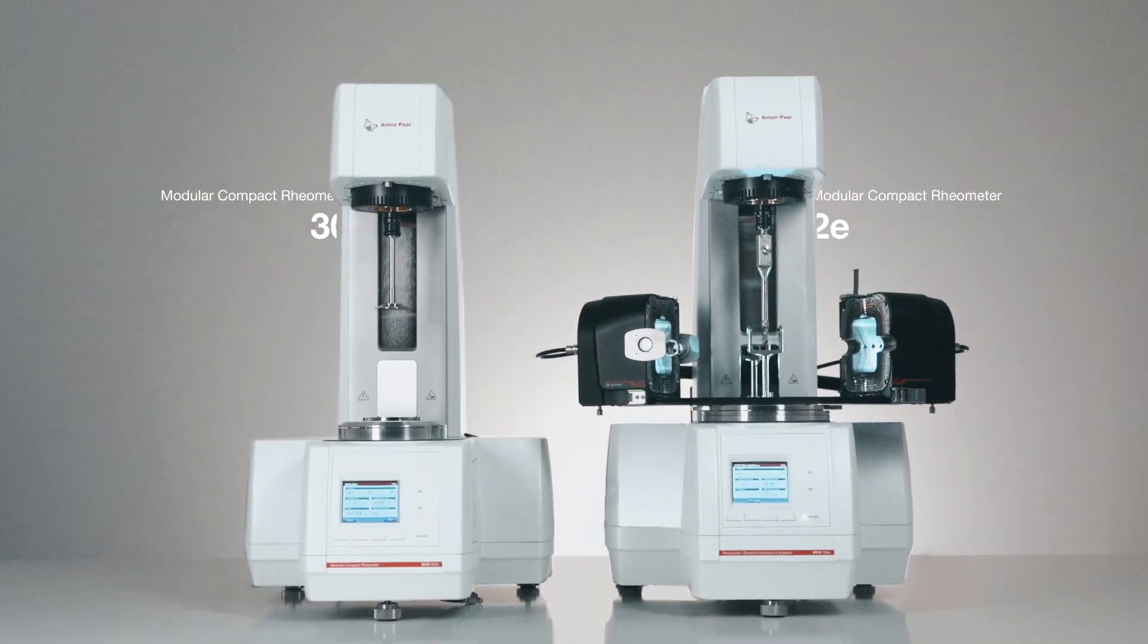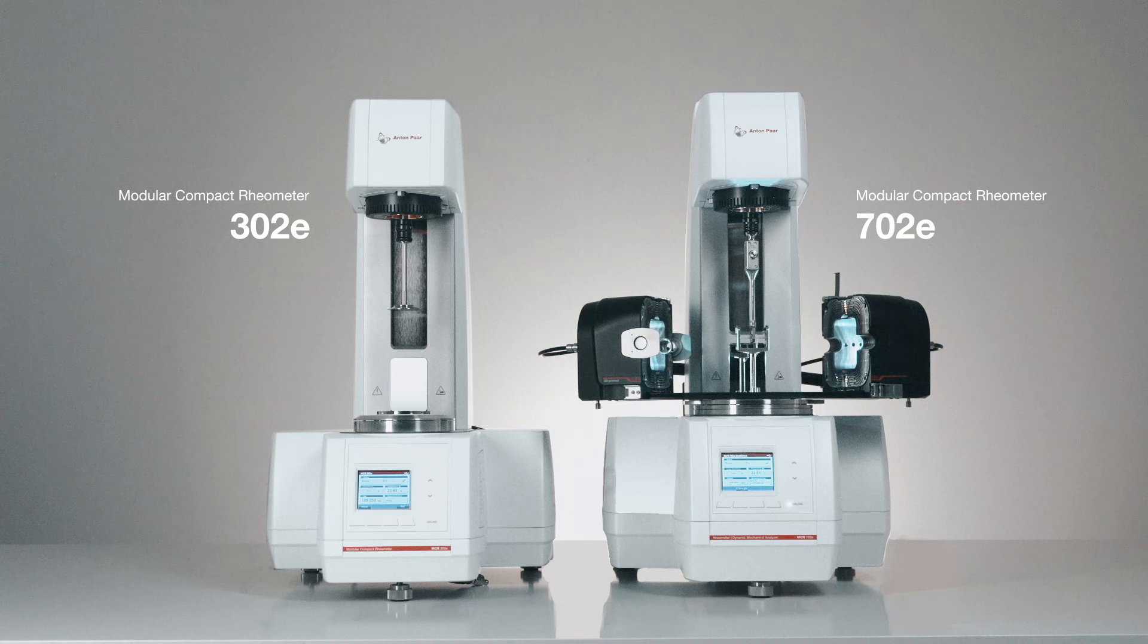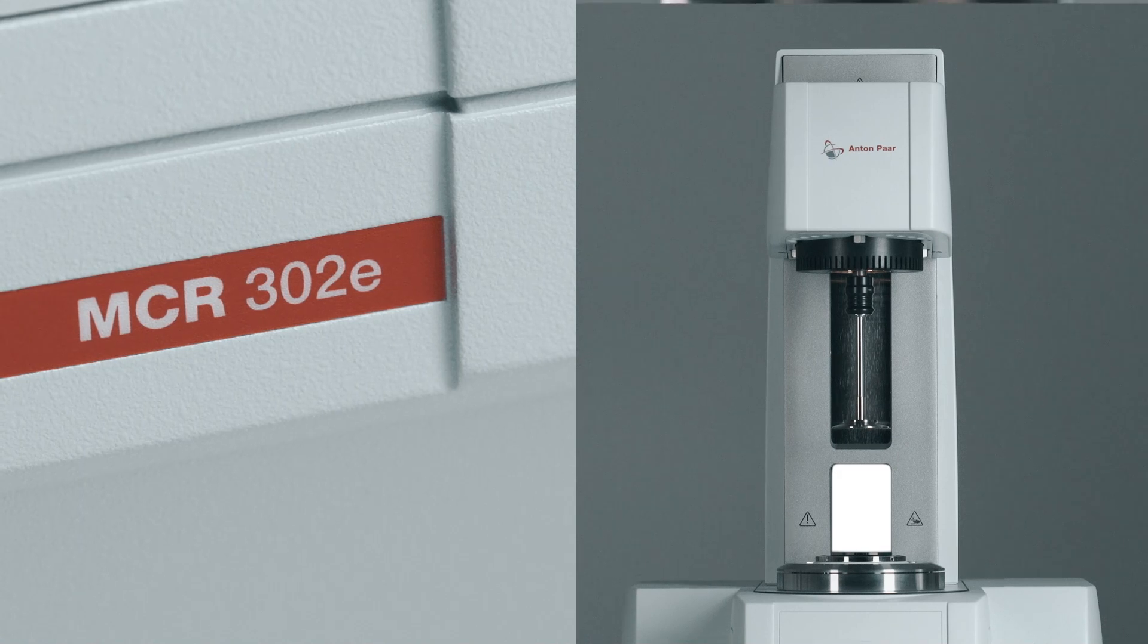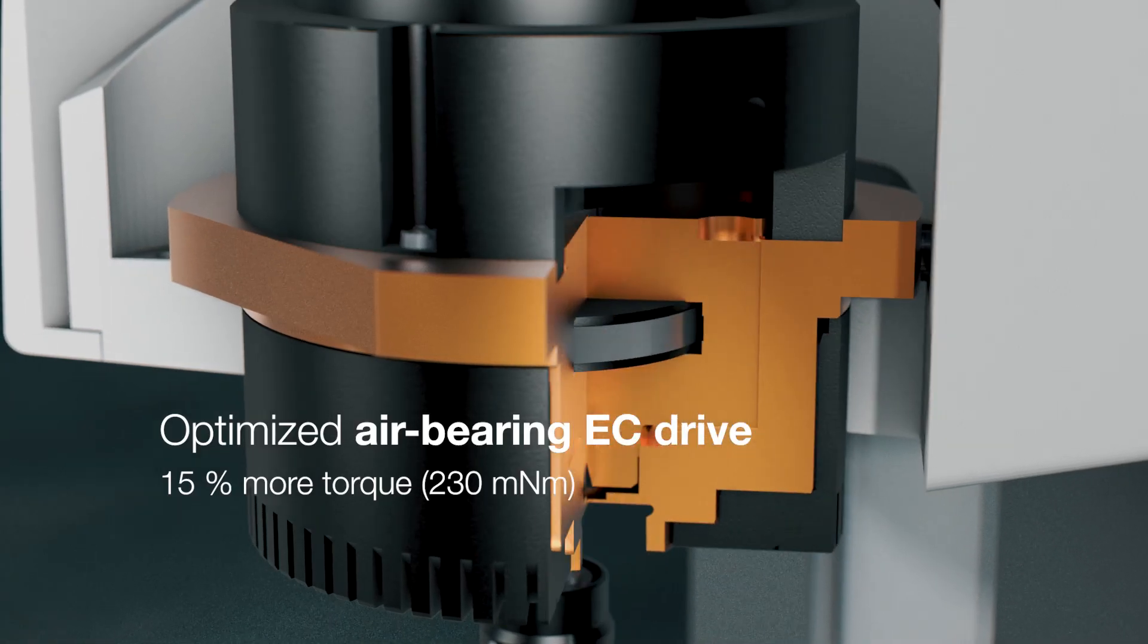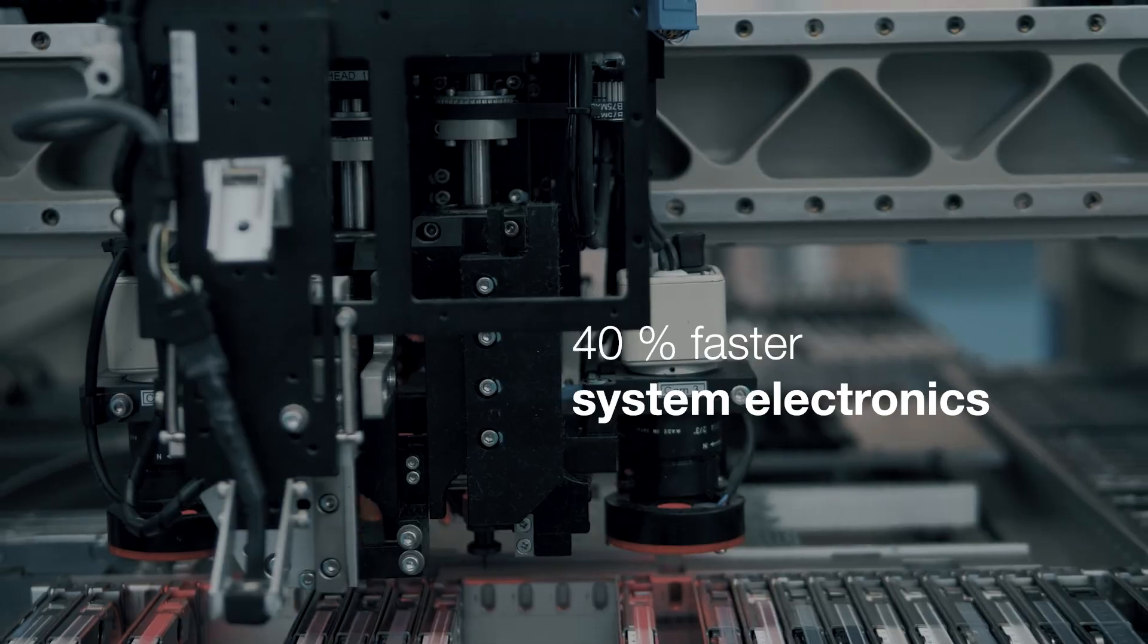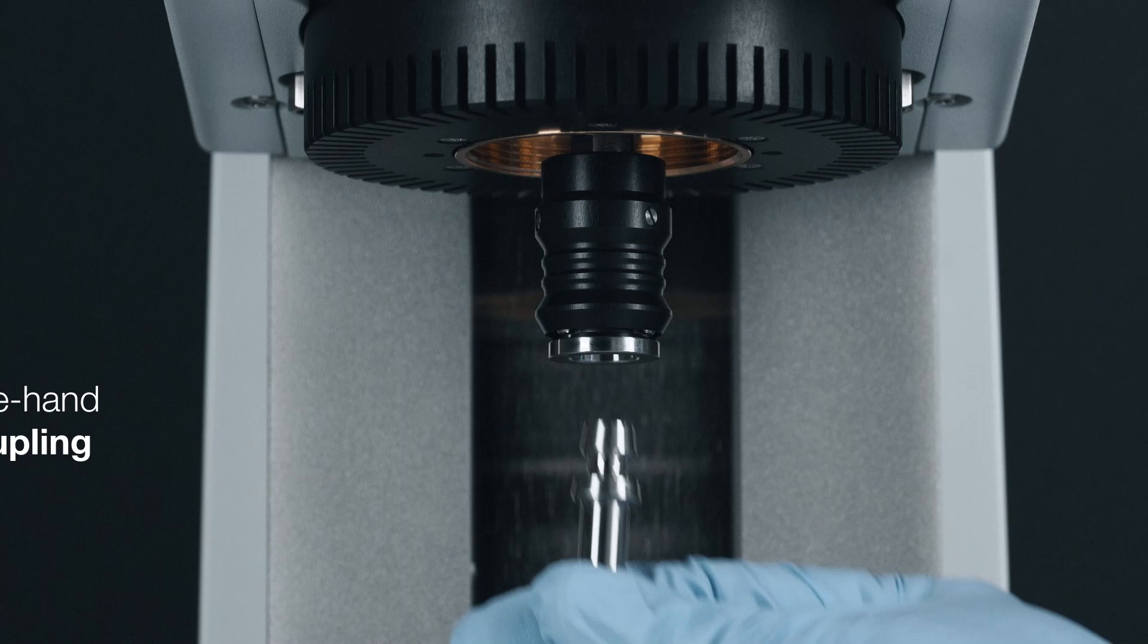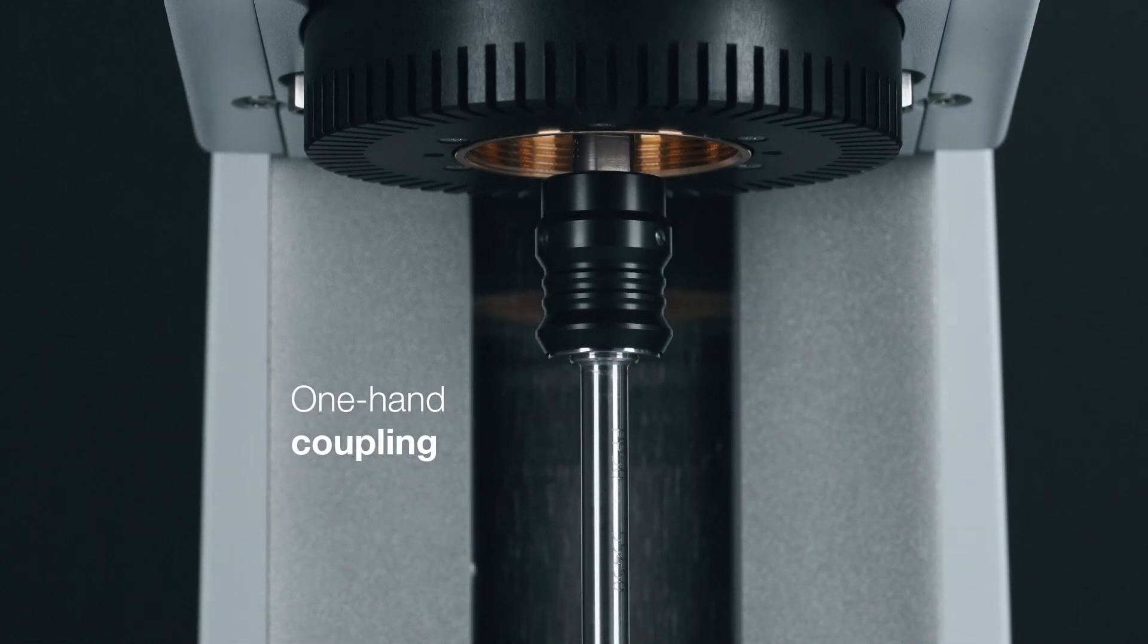MCR 302 and 702 are benchmarks in their segments. MCR 302 Evolution is the world's best-selling rheometer made even better. Optimized air bearing EC drive. 40% faster system electronics. Improved thermal management. And one-hand coupling. Ingredients for success in challenging environments.